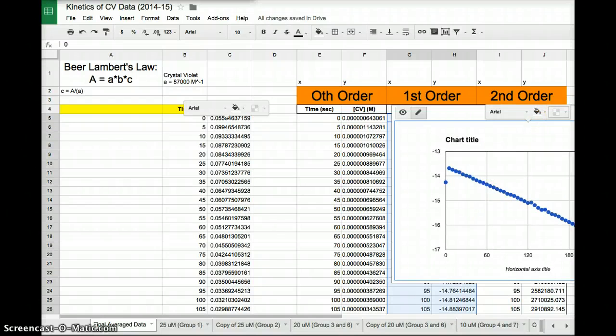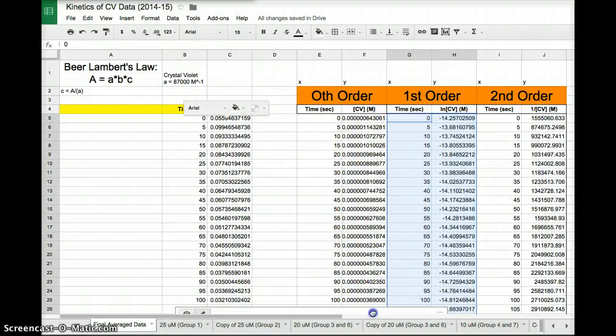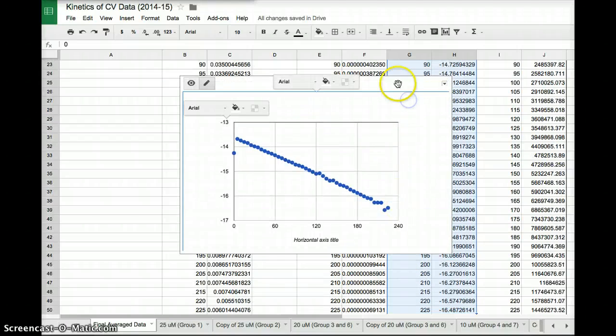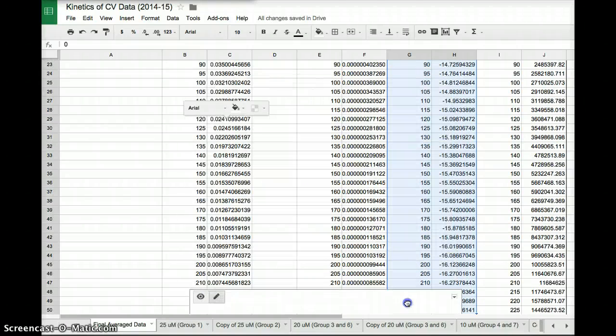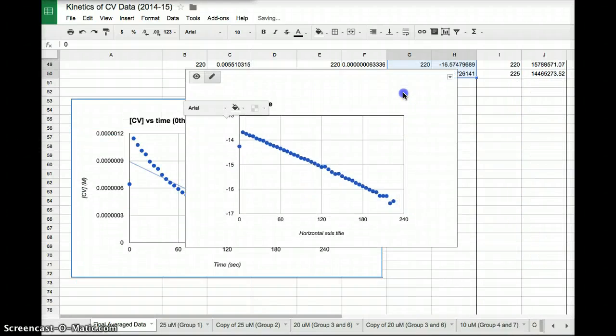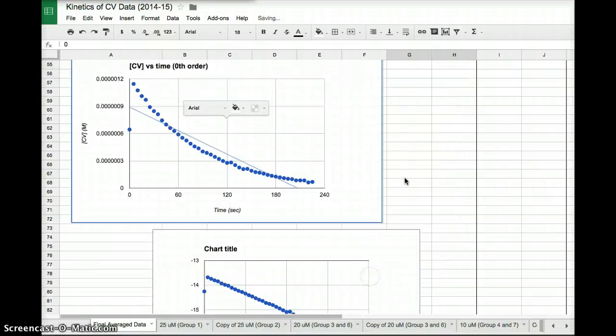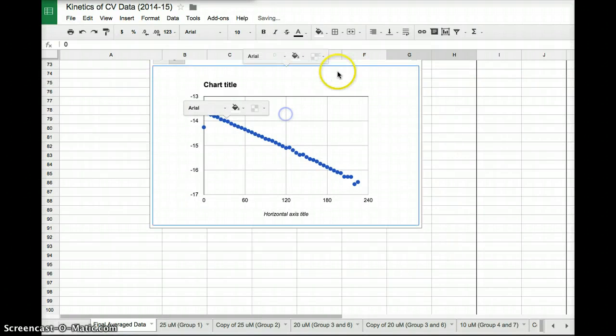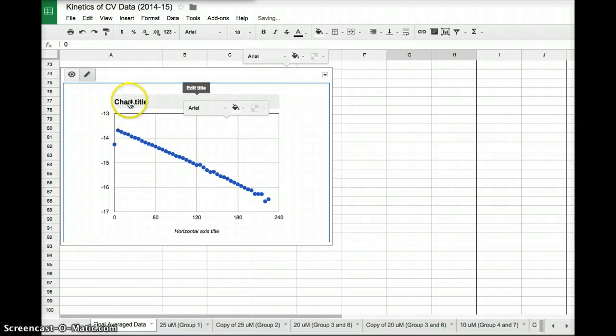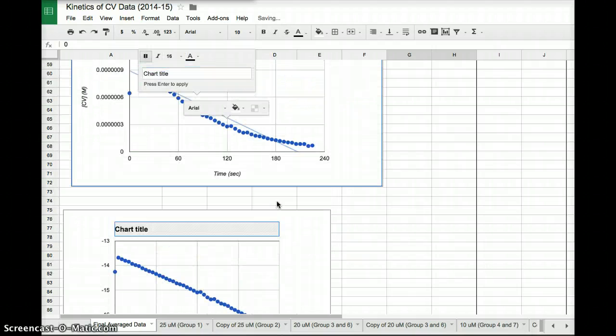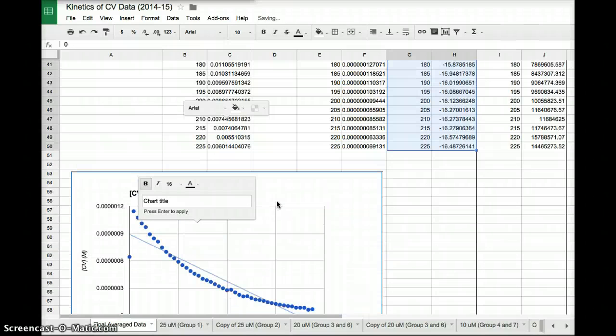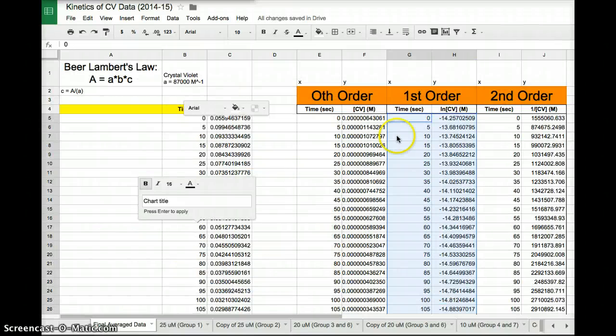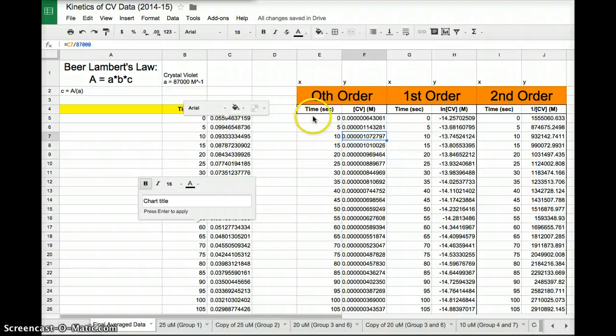We'll want to drag this down so it's somewhere where we can manipulate it. And you'll want to do the same thing as before. You'll want to label the chart title, label the axes, get the trend line, and the r squared value. Once you've created all three graphs, you should be able to figure out the order of the reaction with respect to crystal violet. No problem.